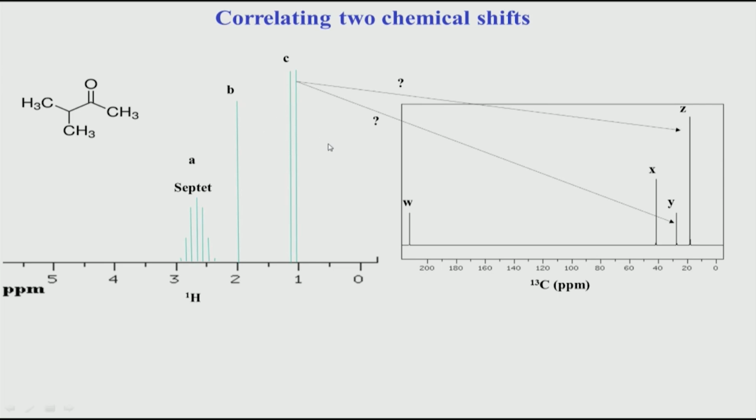So, in the next slide we will see a simple 2D, but I am not going to right now. We will not see how the 2D is recorded, we will come to that later. Let us now look at how a 2D can help for this problem. So, what is the problem in hand?